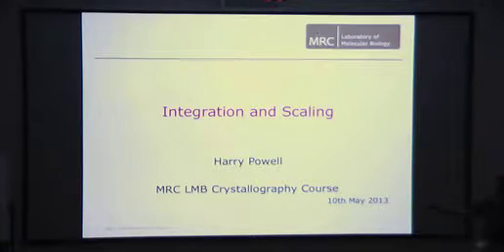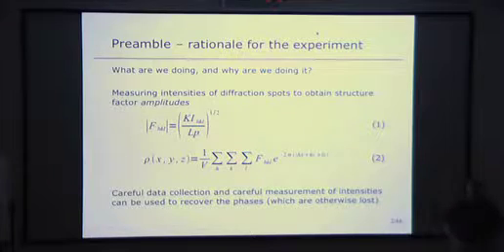Okay, data integration and scaling is extremely important, the last stage before you start solving the structure. That's what I'm going to talk about today.